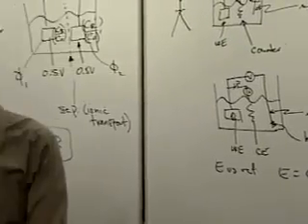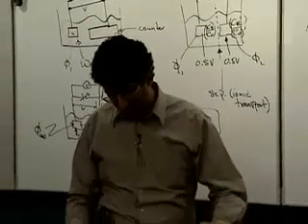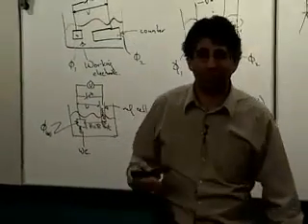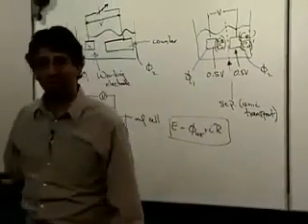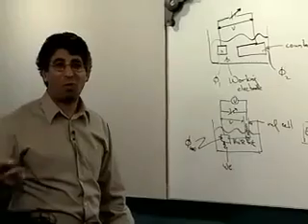Okay, so now we have our cell built. Now the only problem is this freshman we have sitting there maintaining our potential is a little bit problematic. He likes to eat, take time off to listen to his iPod or whatever, and it just won't work through the night.